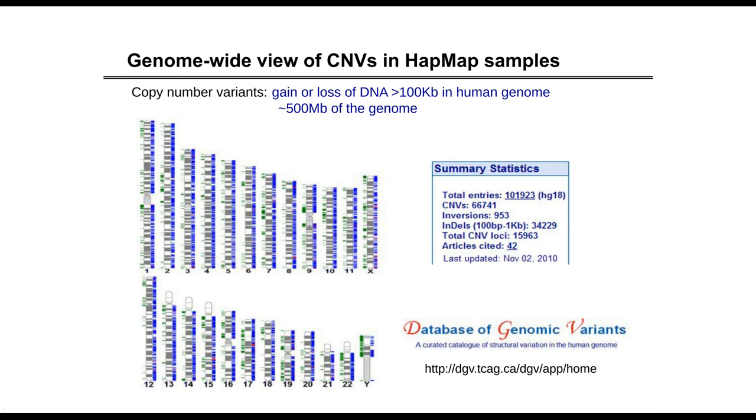No matter whether we are talking about chromosome 1 or the sex chromosome, there are a lot of small segments of changes. And even in the old days, we knew that these could total more than 500 million base pairs. You can see that what I captured in the box is the data from the DGV, which is the Database of Genomic Variants. I'm sure most of you that work in genetics will be familiar with that.